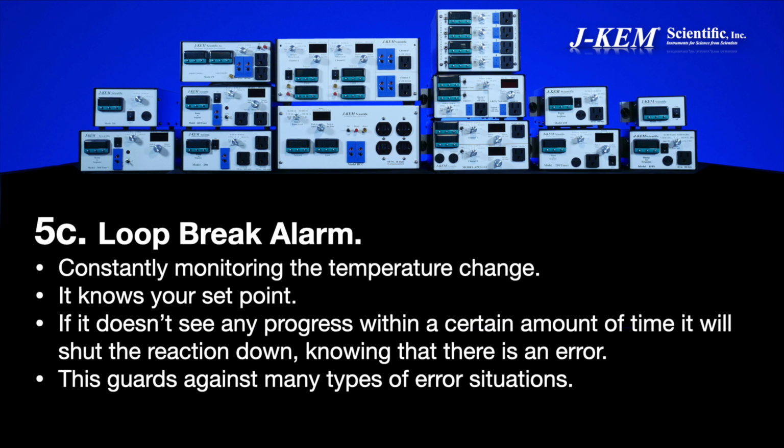It's not uncommon for a chemist to set up a reaction. They enter a set point, for example, of 80 degrees, and then they forget to put the thermocouple in the solution. They leave the thermocouple sitting on the bench and they walk away. Well, the problem with that situation is you've just entered a set point of 80 degrees, and so the temperature controller is going to do what it's supposed to do. It's going to heat. But the thermocouple's on the bench, so there's no feedback of that reaction heating up.